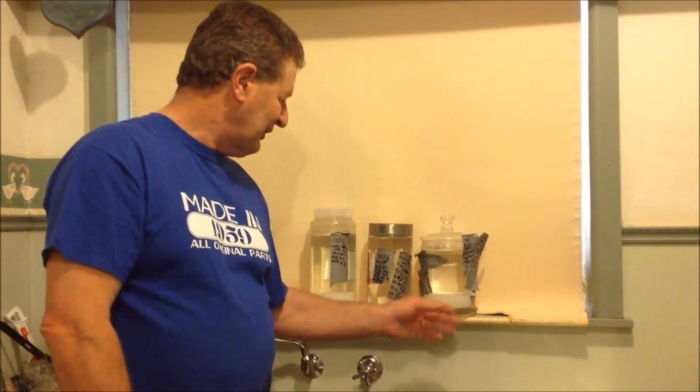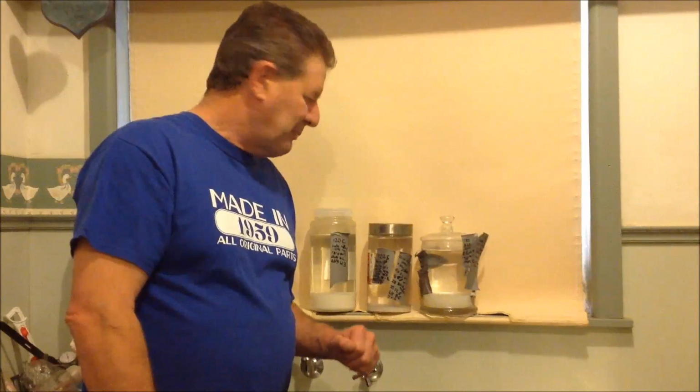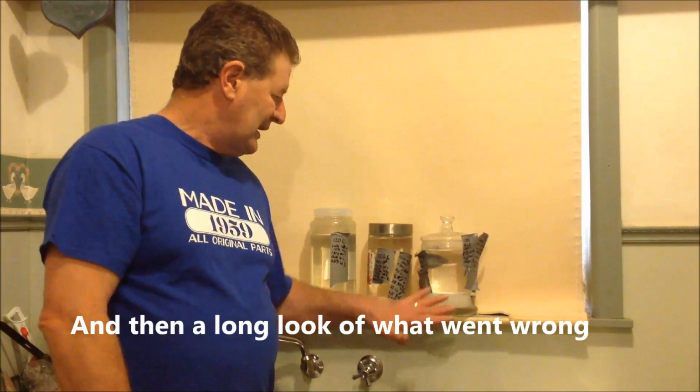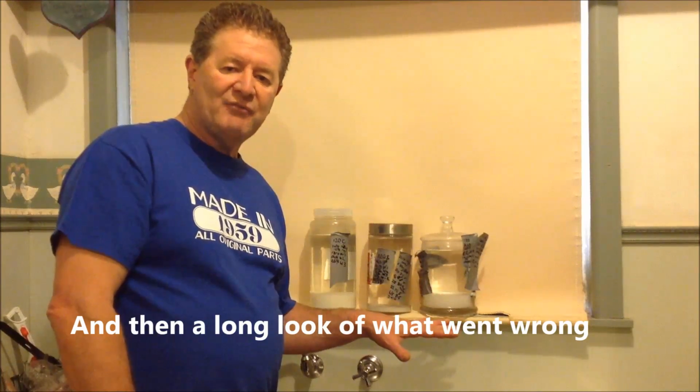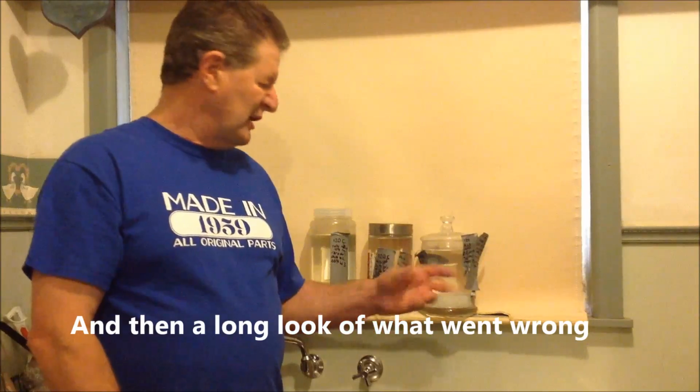But it appears to my eye that I was not successful in reducing the amount of magnesium hydroxide that was produced. And so I'll probably be calling this experiment to close. I'll give you a quick look at the plan for the experiment and the flowchart, and then compare that with the flowchart of what actually happened, and then you can get into watching some of the more interesting things that happened in the experiment.